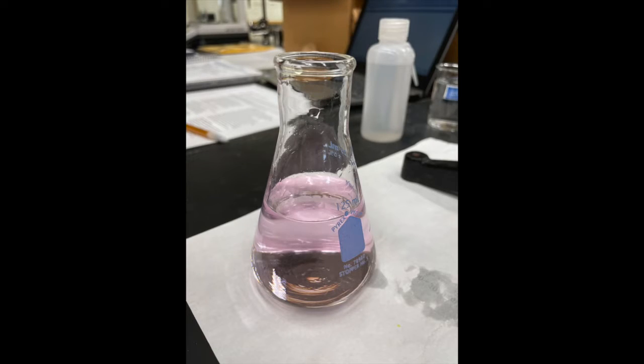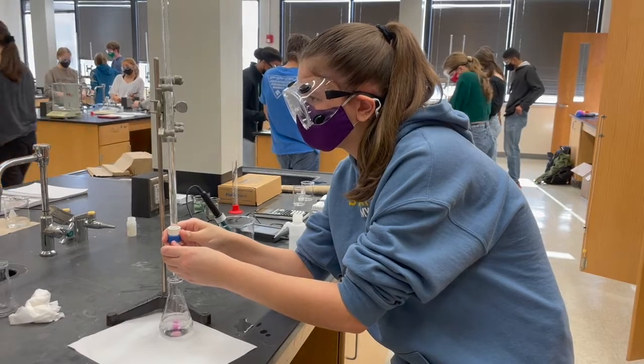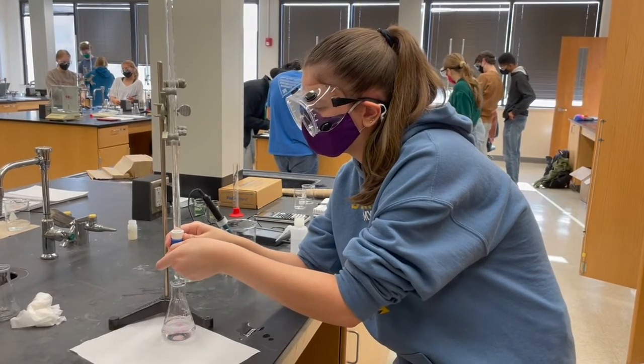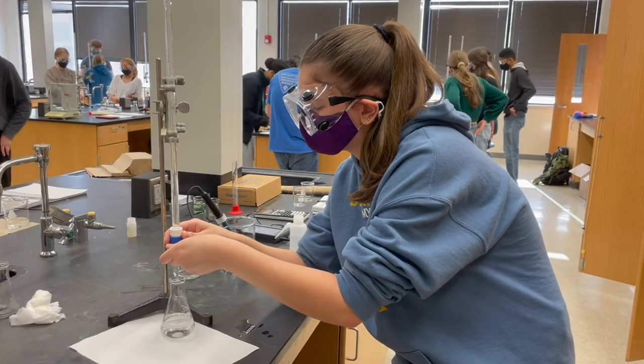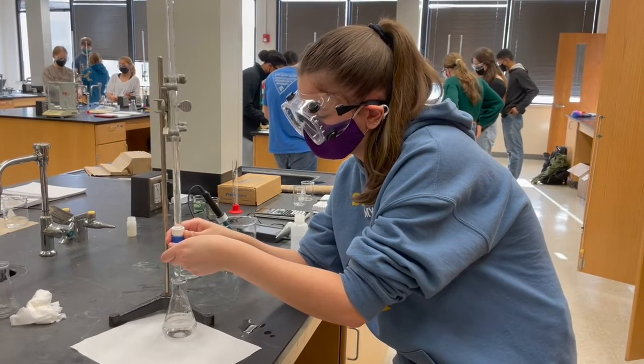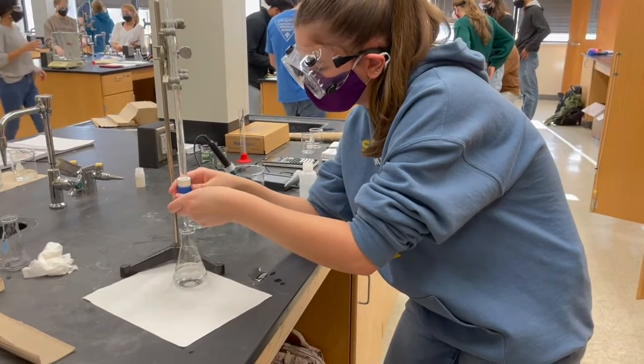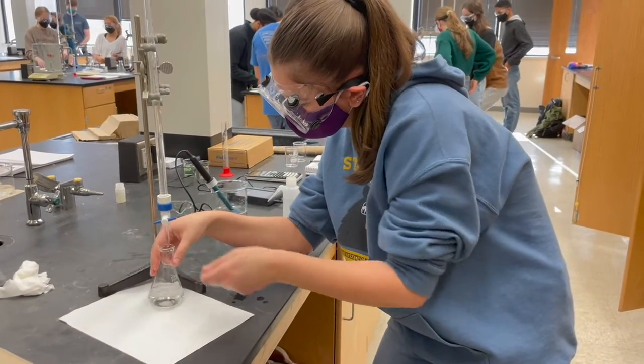We continued the titrations until our solution turned a light pink, signaling that it had reached its endpoint. We repeated the same steps from the titration of the known acid for the titration of an unknown acid. We measured the initial volume of the titrant, added titrant to the unknown acid and phenolphthalein mixture, measured the final volume of the titrant, documented the data, and repeated until the solution turned light pink.